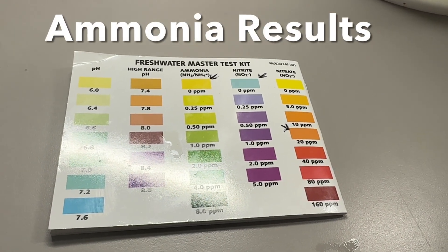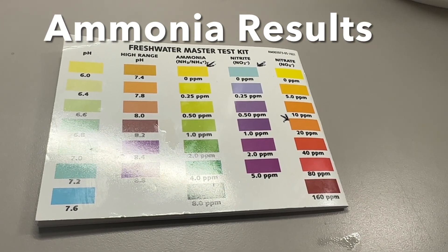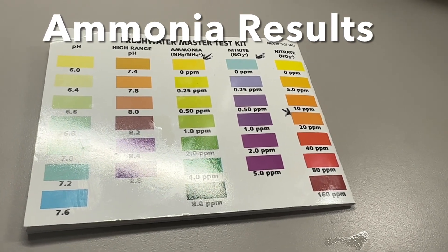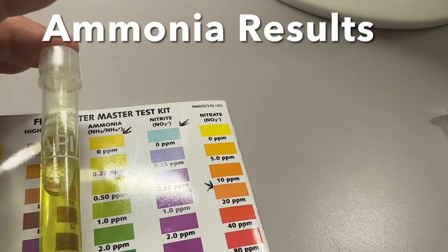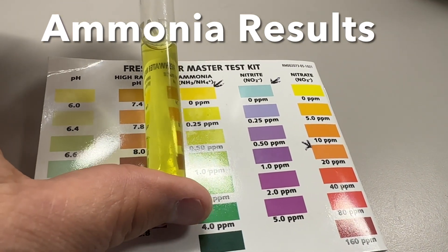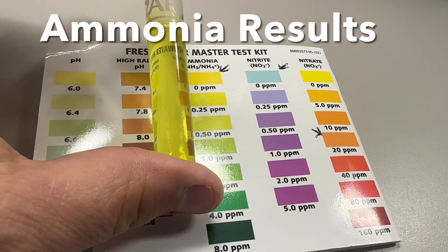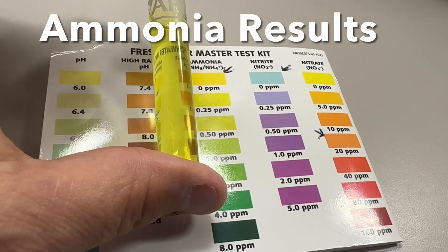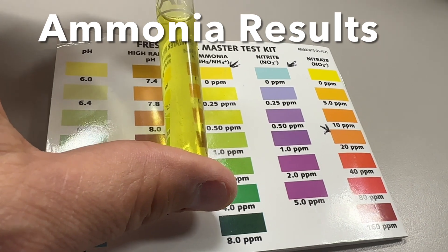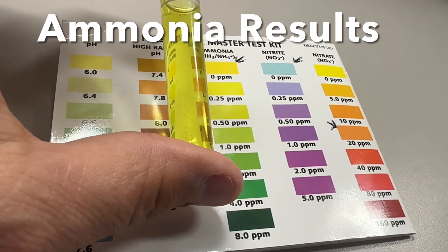We're going for zero parts per million on the ammonia test. If it gets up to 0.50 you're getting too high and need to do a water change or take some action. After five minutes, this test kit is looking like it's between zero and 0.25 — it's yellow, so it's good. If it starts turning greenish-yellow, you know you've got to adjust.